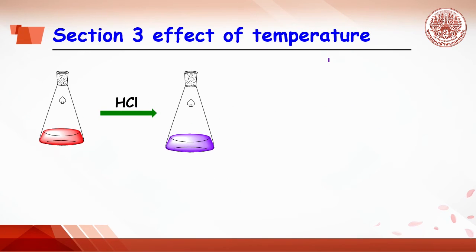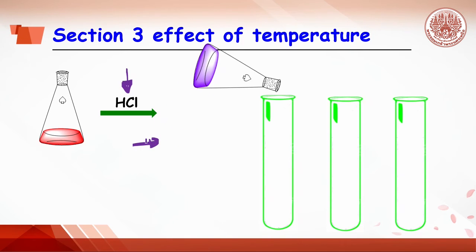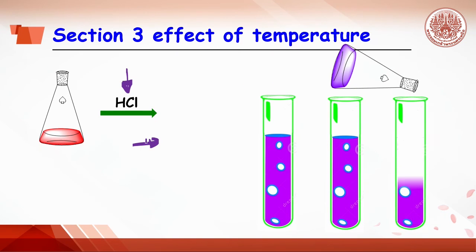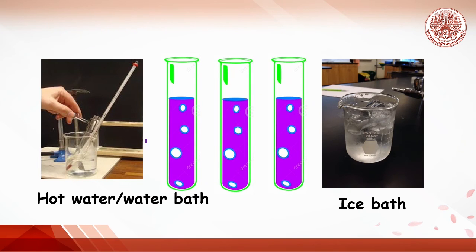Section 3: effect of the temperature on shifting the equilibrium position, and determine whether the reaction is exothermic or endothermic. Hydrochloric acid is added into the cobalt solution till purple color appears. Pour or drop the solution in 3 test tubes. Place the first test tube into the hot water and the second test tube into cooling bath or ice bath for 1-2 minutes. Observe the color change.